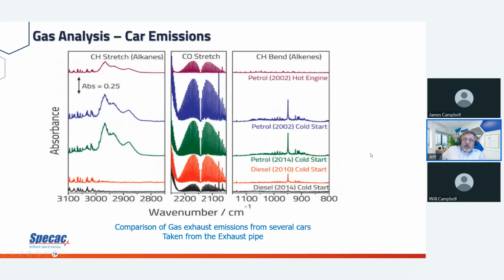So it came up that we were working on this, and somebody asked, what can we do to test the gas cell? And somebody said, let's use some car exhaust. So they just went up to the cars, did a couple different cars. Here's a petrol engine that was done in the UK. So I'd call it gasoline.